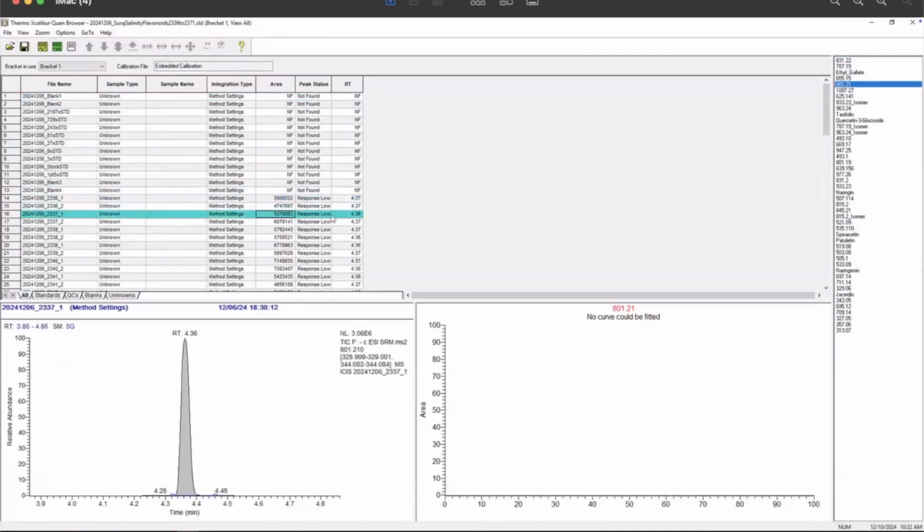So a good peak is going to be integrated baseline to baseline. It's going to have a nice Gaussian curve. What we don't want to see is, maybe, I'm going to show you an example here. We don't want to see anything that looks like this. That's clearly wrong. That's not the entire peak area. So the way that the processing method is set up is usually pretty effective. Especially for analytes like this, I really don't see any major issues if we just have a singular peak.